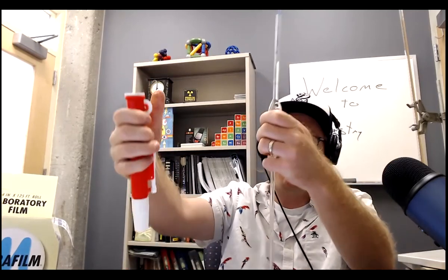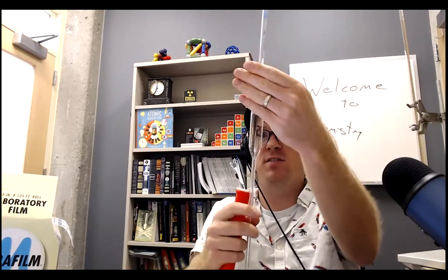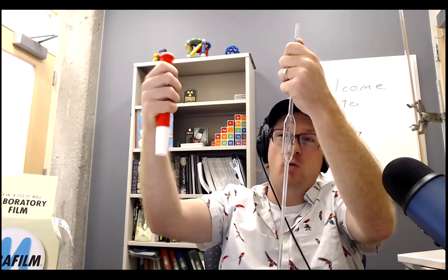You want to first rinse your pipette. So imagine I've got a little beaker right here. This is a pipette aid. Put it over the top. I like to hold my pipette with my left hand near the top. You want your fingers near the very top because you want to be able to use your thumb like this. So then you've got the pipette aid. I hold that in my right hand.